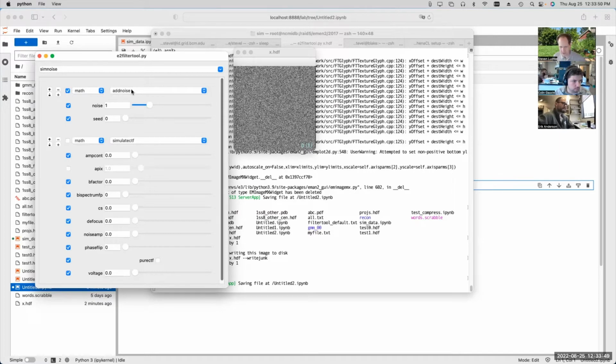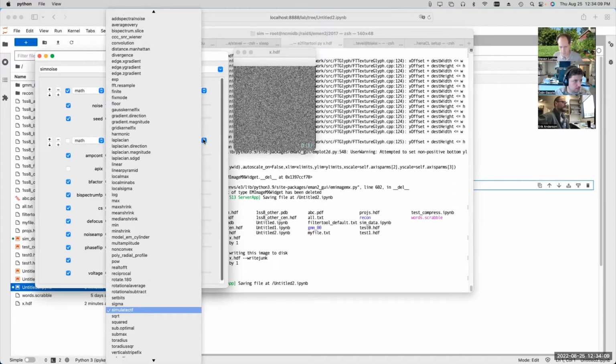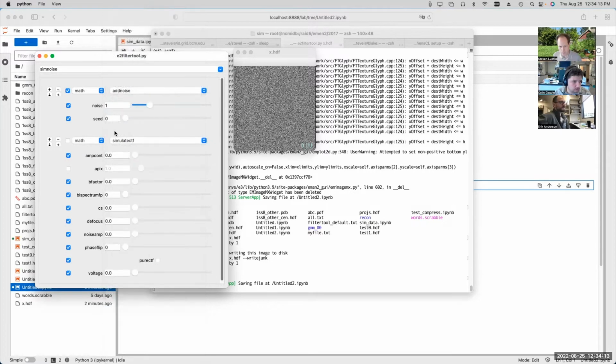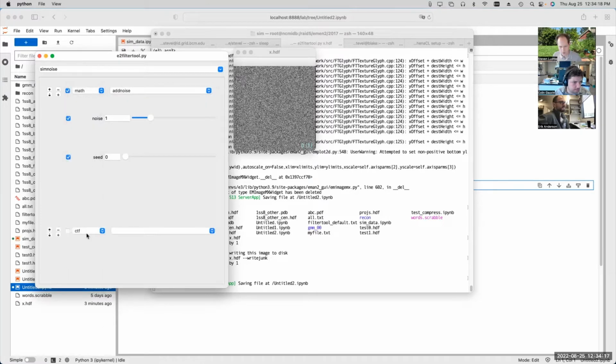Well, and there's no sig in this because I'm not using the standard deviation as a basis. What would the CTF filters have done? Because there was a CTF underscore and I think a CTF in the filter tab. There were things called CTF, I believe, when you're in filter. This one, or you mean under filter? Under filter, yeah.